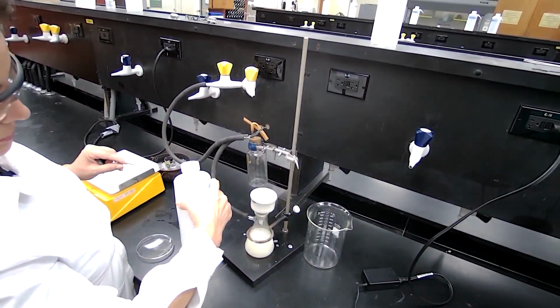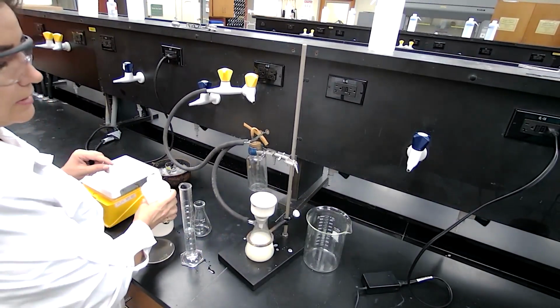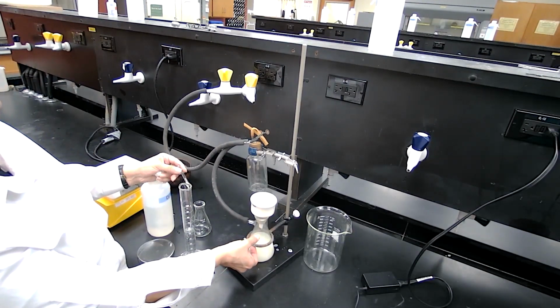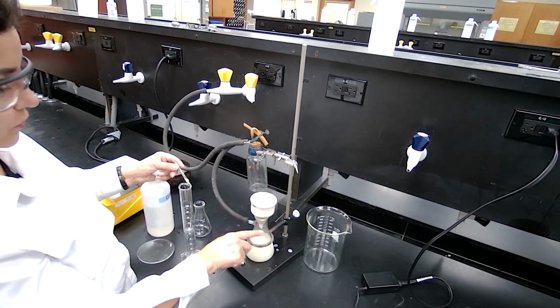Now, this is our 3rd time washing with an additional 50 milliliters. If I place 50 milliliters more, I don't want the flask to be filled up for more than 2/3.